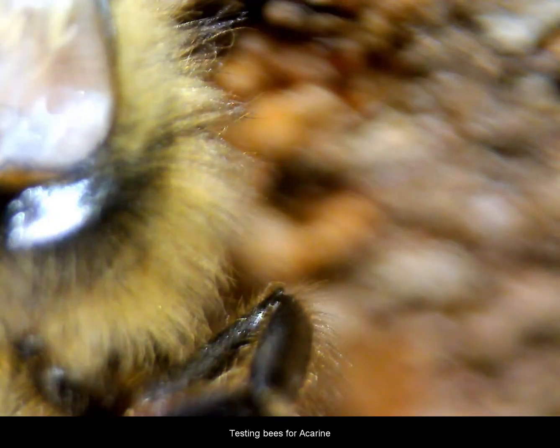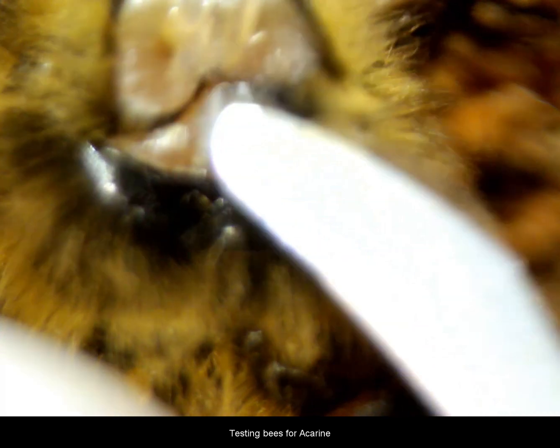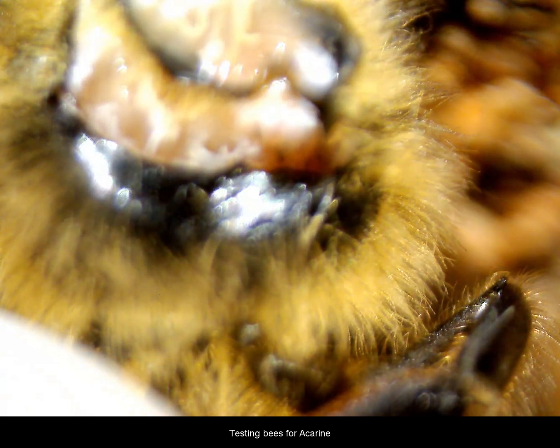I'm increasing the magnification from 10 times to 20 times just because it makes it easier to view what I'm actually trying to do here. I'm about to put a scalpel in underneath what we call the collar of the bee. You can see the scalpel going in there to score across the bottom of it to loosen that collar. Once we have that collar loosened, we should be able to grab it with the forceps and remove it, opening the shoulders of the honeybee to see where the first spiracle is and the trachea connected to it, to make sure that the spiracles and the trachea are completely white.